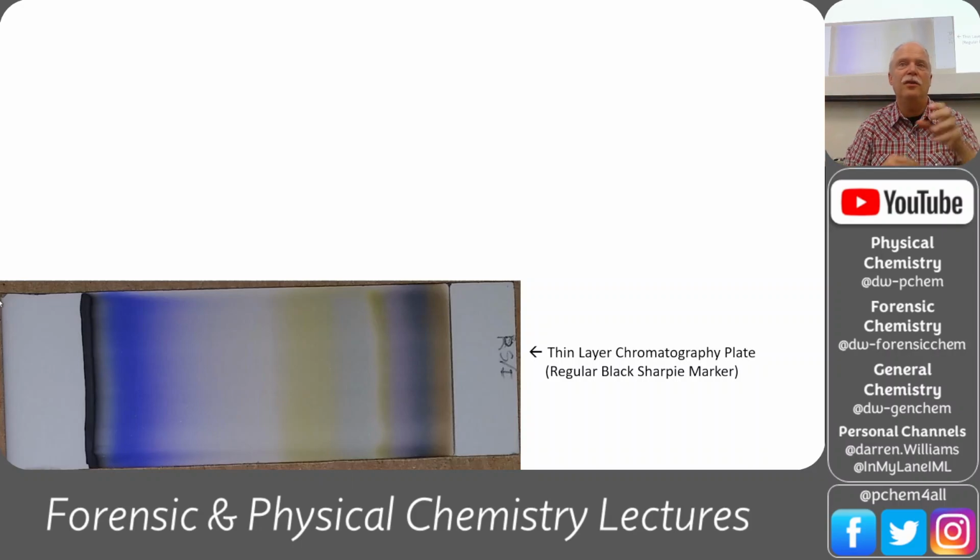And then they also have, we've analyzed Sharpie quite a bit because we use it to test cleaning equipment. So if you're testing an ultrasonic tank or some sort of cleaning equipment or some sort of solvent method, we mark up a frosted or microscope slide with Sharpie and see if that solvent blend will clean the Sharpie. It's a good test soil. And you can take photographs and sort of measure how dark the surface is to see how clean it is. So that's a really good test soil.